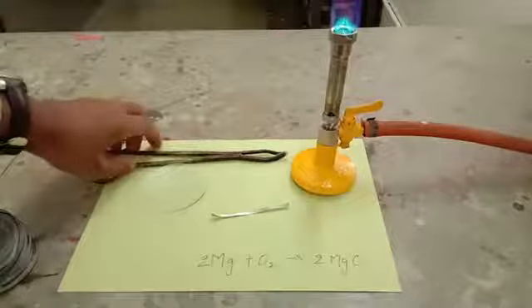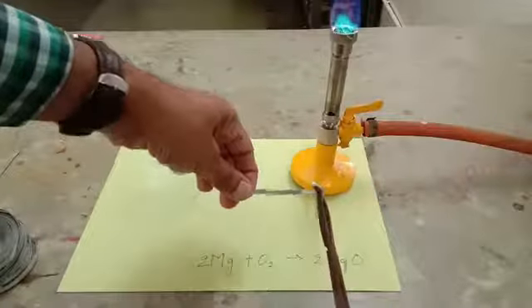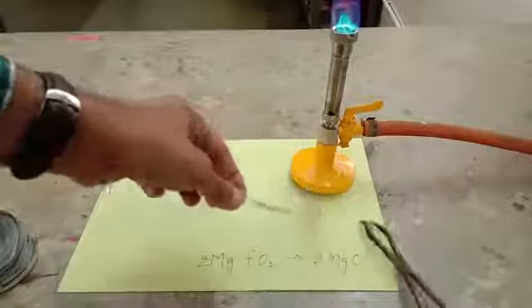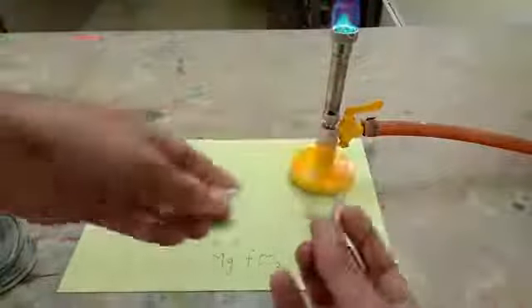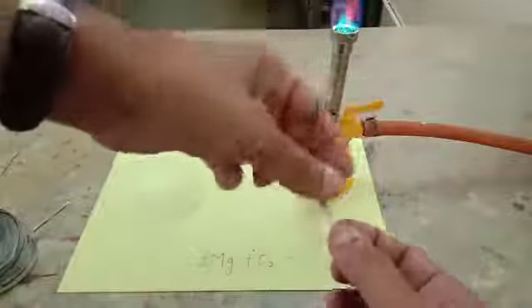Let's try the experiment and here I am going to hold this magnesium ribbon. Actually we don't require a very big piece of magnesium. It is very handy. You can even break it with your own hands. So I choose to put all other things aside.